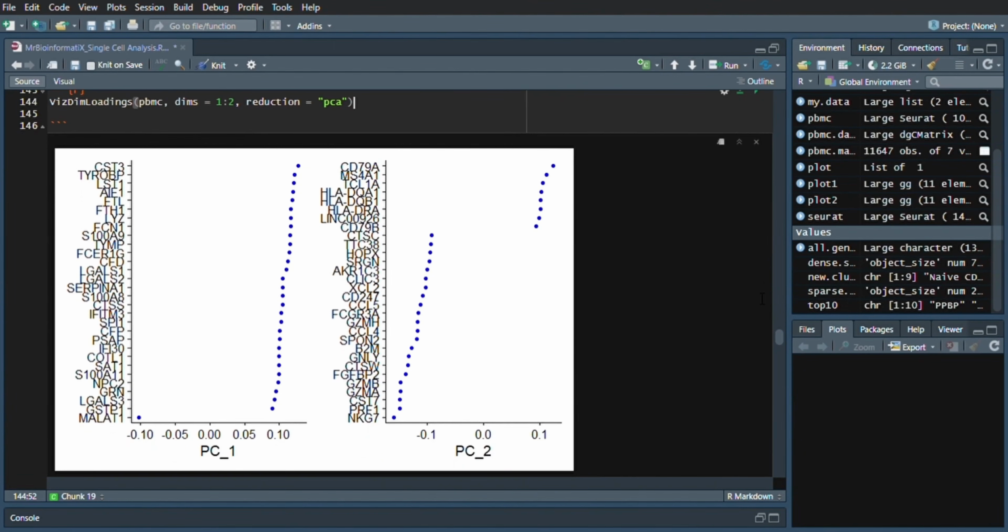As you can see, we put dimension equal 2, so we got it for PC1 and PC2. The top genes are associated with each principal component. We can see also which genes are important for PC1. Also, we can see the relation between the genes and the principal component, as here is positive related as direct, or negative as indirect.